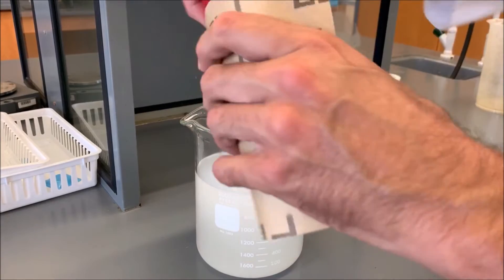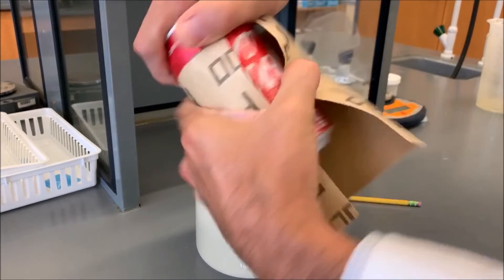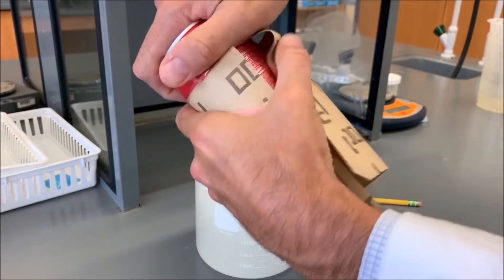While that's dissolving, we can rough up the can a little bit — just try and remove some of the paint from the exterior. That just makes it easier for the aluminum to be attacked by the sodium hydroxide.